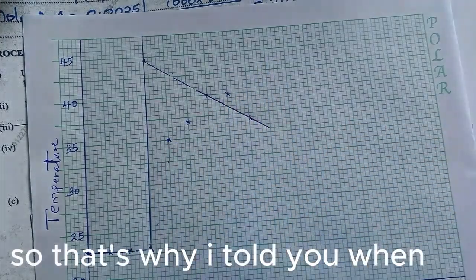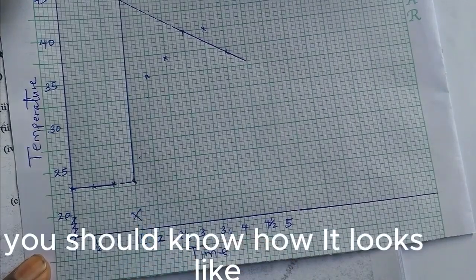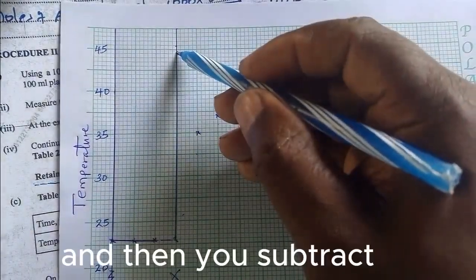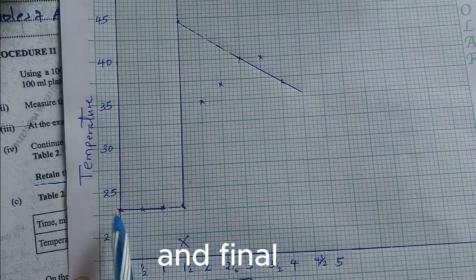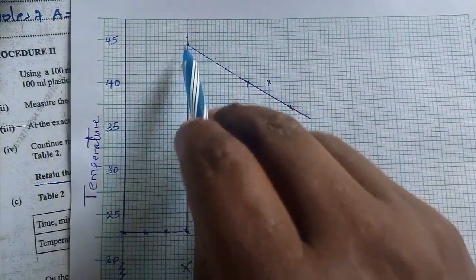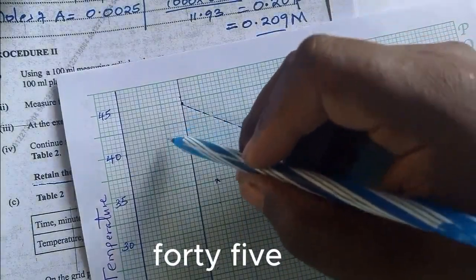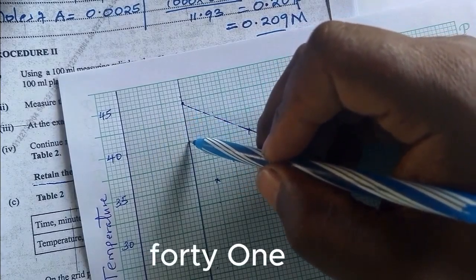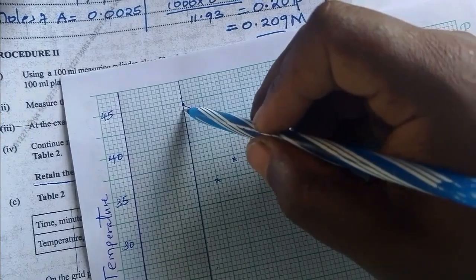So that's why I told you, when the curve has a break, you should know how it looks like. That's very important. Now you read at this temperature and then you subtract. So temperature change will be the initial and final, you subtract. So let us read. This one is going to be 45, 40, 41, 42, 43, 44, and 0.5.